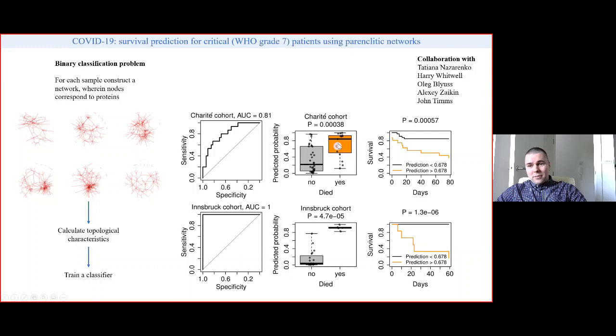We don't have full statistical characterization, just not enough samples to tell. You can see we get kind of different box plots in one case and another case. But it does seem like we're able to tell quite confidently that certain patients are very low risk. It's not as high confidence when telling that a particular patient is high risk.